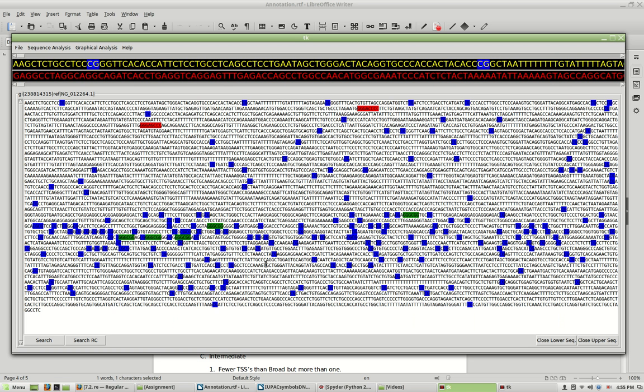So if this was a promoter, maybe it's a promoter for a different gene. There are 2 genes in this sequence. I'll give you a hint. And 2 known genes. Maybe there are more. Maybe you'll find an additional one that we don't know about by analyzing it. But the idea here is these, all right, the red ones, are outside of the parameter that we're looking for. We're looking around this CpG island. This is the hint that's telling us that this is interesting. This is what I'm interested in.